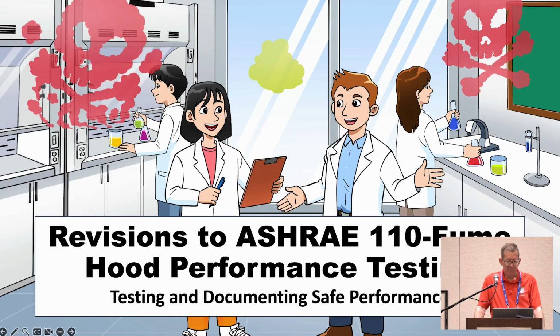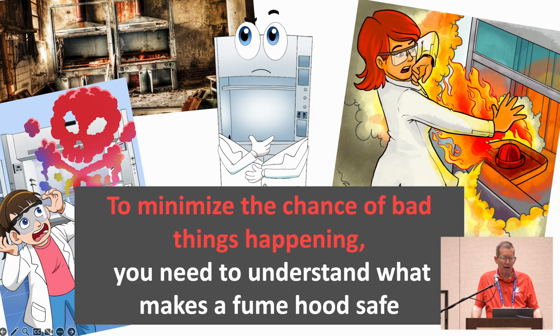Okay, so to minimize the chance of something bad happening in your fume hood, you need to understand what makes a fume hood safe. This graphic in the upper right is in memory of Sheri Sangji, who burned to death in her laboratory at UCLA in 2008. Our president and founder, Chip Albright, is just finishing a book on this incident.